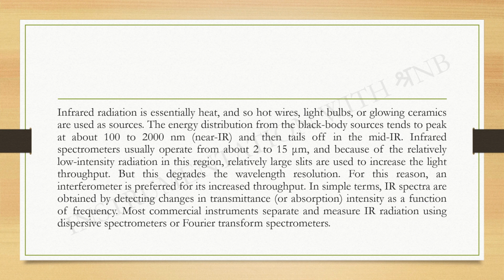So the intensity of radiation is less in the mid IR region as compared to the near IR region. To overcome this, large slits are used, but as I have already discussed, large slits can increase the sensitivity, but the resolution will get decreased.